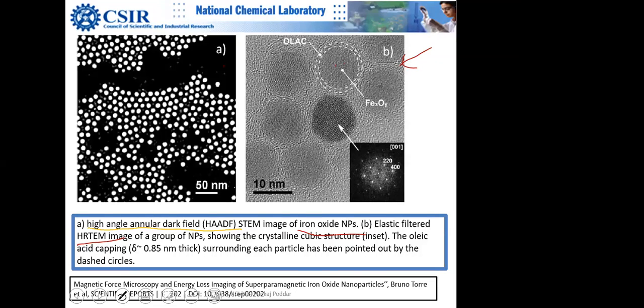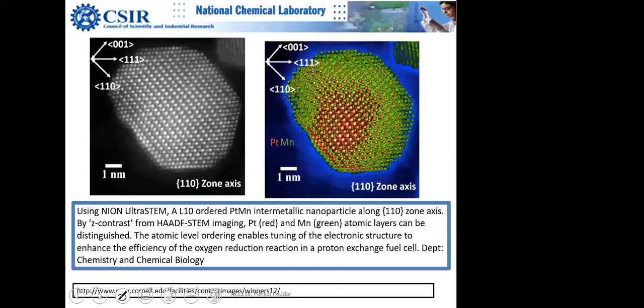Of course, you should not try to precisely calculate the stoichiometry, Fe x and y. To a certain approximation you can calculate x and y, but for perfect stoichiometry calculation, I would suggest that you use EELS or ICP. ICP is better for precision. But there are trade-offs, as you know, that ICP is a global technique; the sampling size is too large. So every technique has got its own problems, and you should be aware of that. I'll skip this.